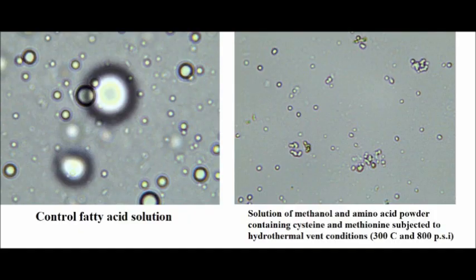So, here you can see the results of this experiment under the microscope. I would say that the experimental solution, when compared with the control, has the same spherical structures which in the control are fatty acid vesicles. Notice how the smaller spherical structures on the experimental slide are virtually identical to the smaller spheres on the control slide.